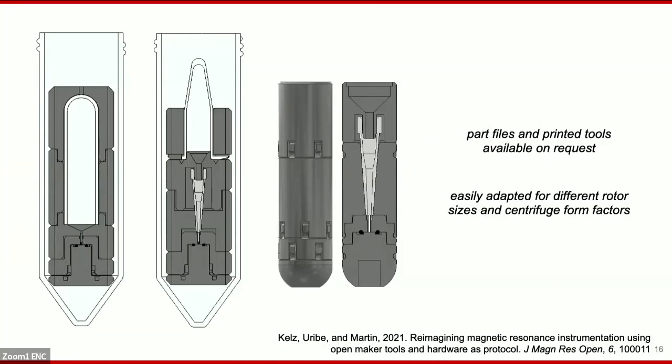I just had one question to clarify. So in the one that you don't use the ultracentrifuge for, do you still cap the rotor in this glove bag with the controlled humidity? Absolutely. I think that may be even one of the most important parts of this protocol, doing everything in that glove bag. We can absolutely ensure that we're not dehydrating our samples.